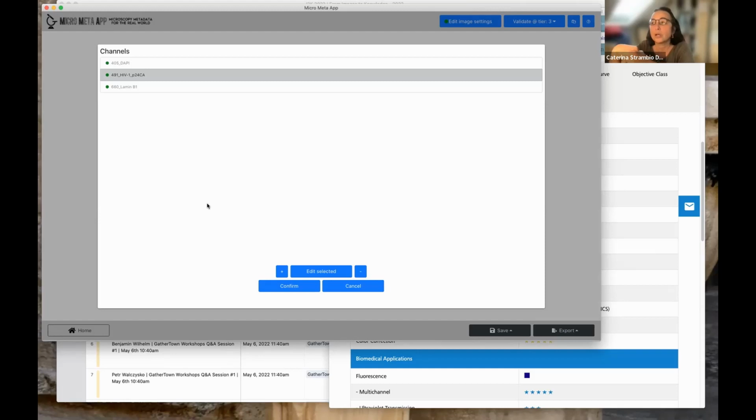So the first step toward that is we did already implement the idea of cloning. If you have more than one filter of the same manufacturer, you can clone it and then just change the individual characteristics of individual filters instead of having to re-enter everything manually. But we are doing this, and we want to implement the idea of accessing pre-filled components that are shared by manufacturers.